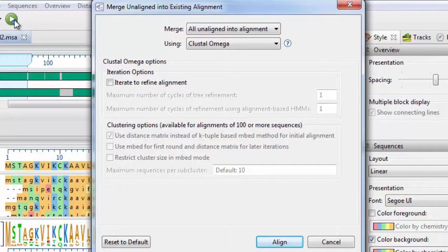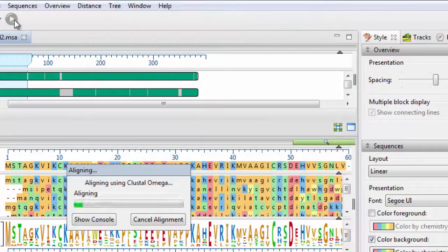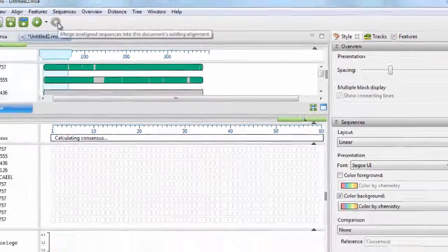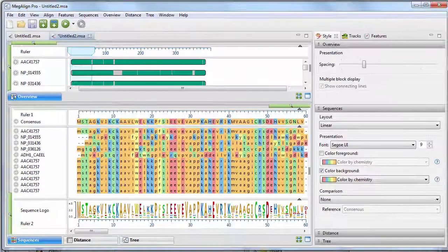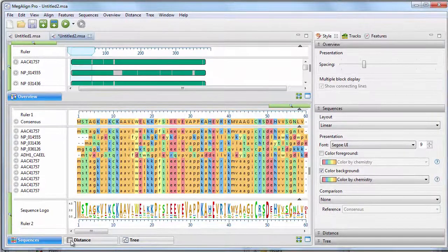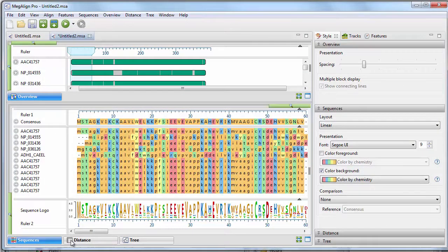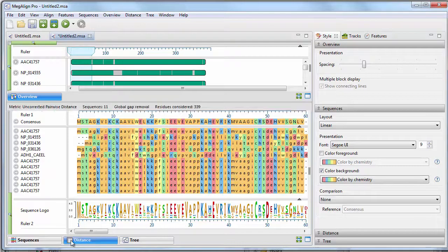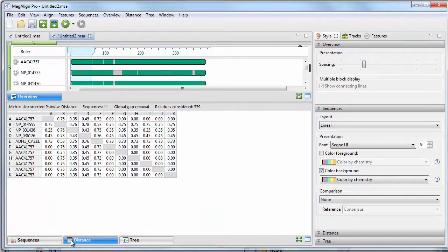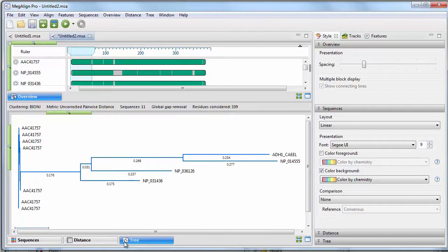Quickly and easily merge alignments or add sequences to an existing alignment. Then, analyze results using a variety of views, including a distance matrix and several phylogenetic trees.